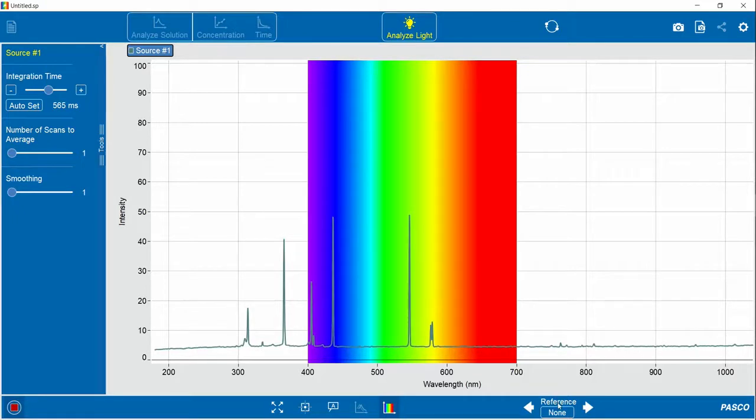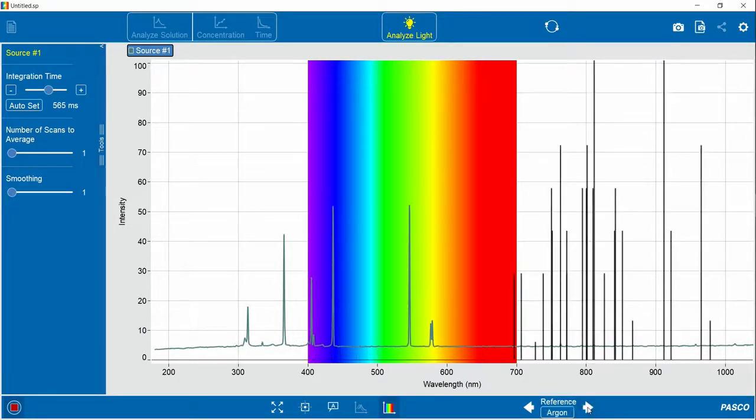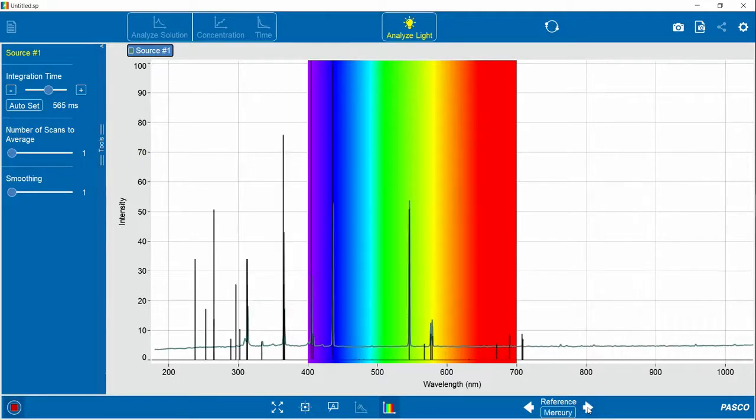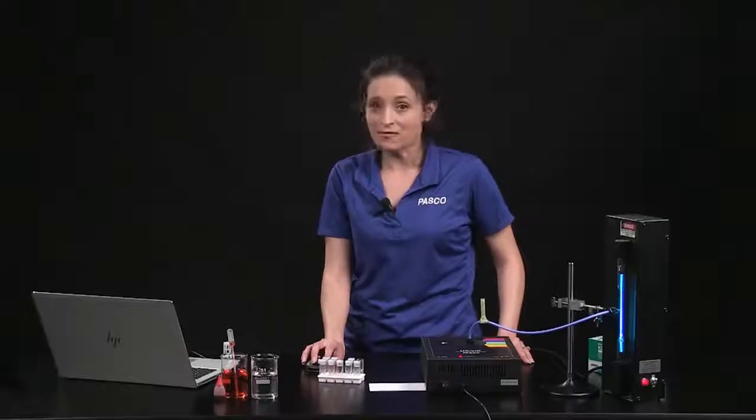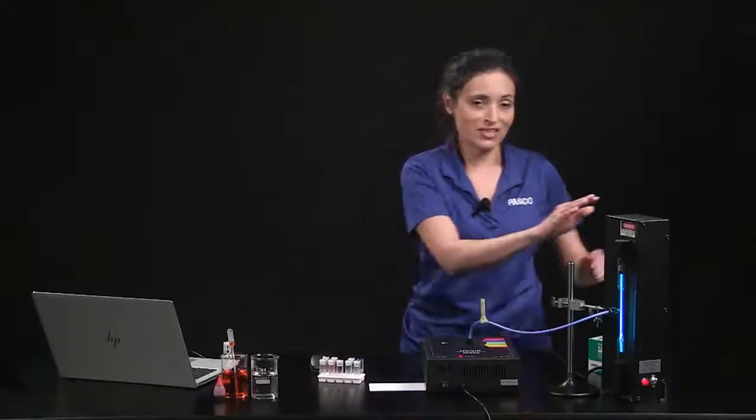And now I can run through the reference lines for known elements. Here's hydrogen, which does not match my data. The next one is helium, does not match. And argon does not match. Neither does xenon. But mercury does match. So these reference lines help you identify an unknown element from a gas discharge tube.